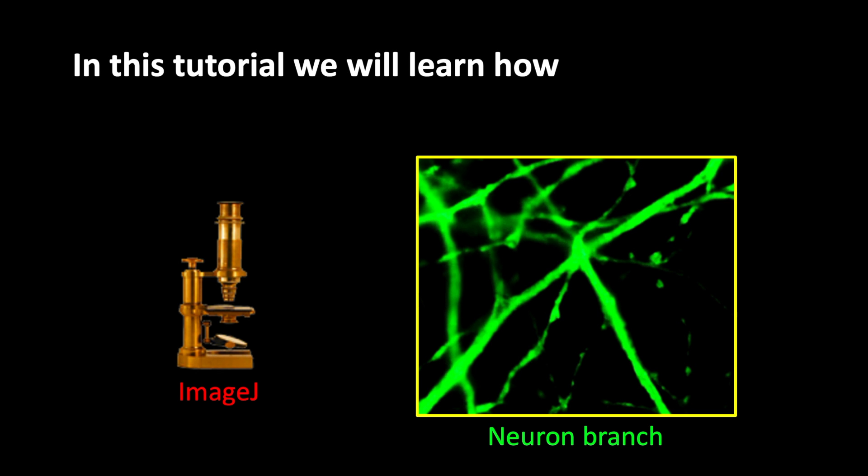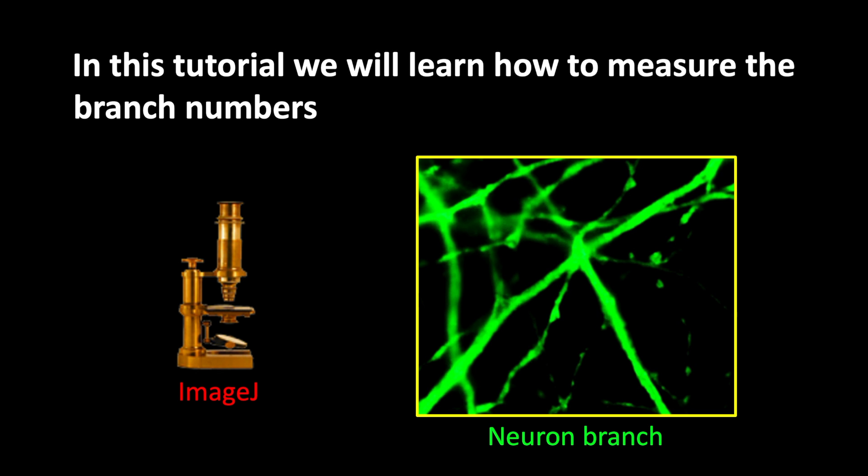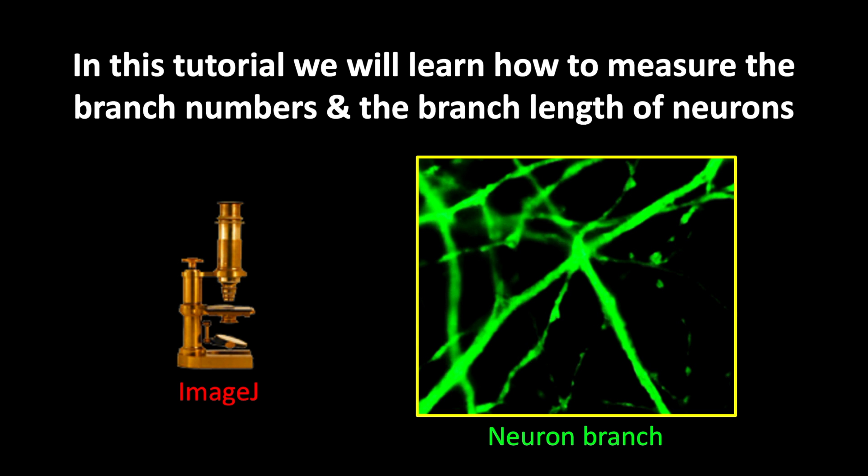In this tutorial, we will learn how to measure the branch numbers and branch length of neurons.